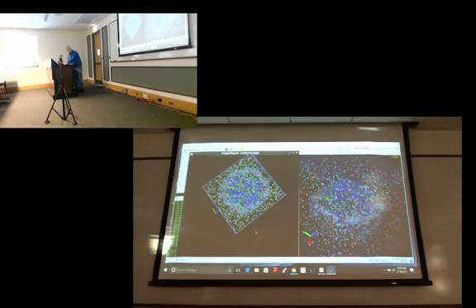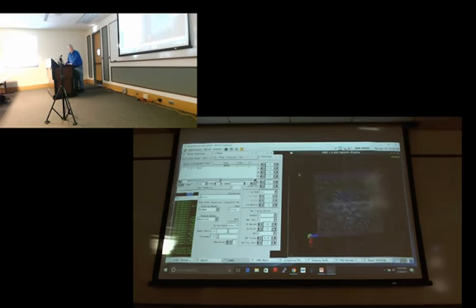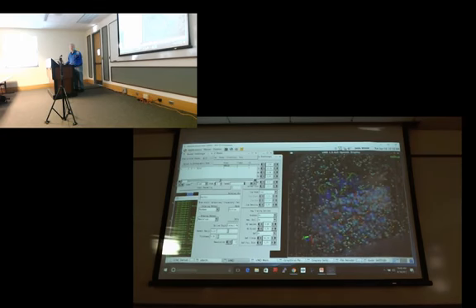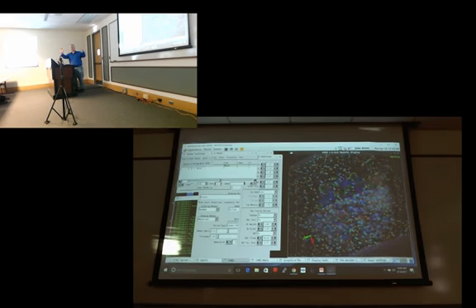VMD has, for example, a tool in it called a ruler. There's a little extensions menu here. These are some of these scripts, by the way. You can write these. One of my friends wrote this little ruler tool. So we'll tell it to turn on the ruler, and we'll have a grid rule. Now look at that. So now we have this grid with a set grid spacing, and when I use an orthographic projection, all the distances you see drawn, whether it's in the front or the back, that's a uniform distance scale all the way from the front and the back. If I were to draw that in perspective, that distance scale is only correct in the exact plane in which it lies. Does that make sense?